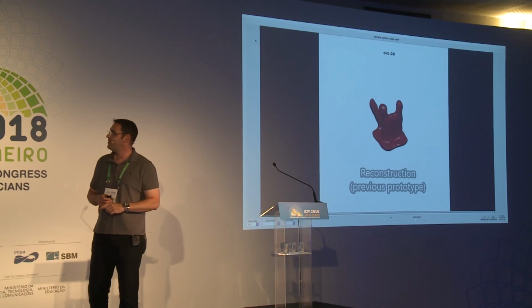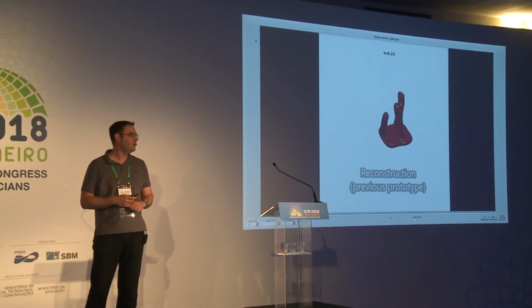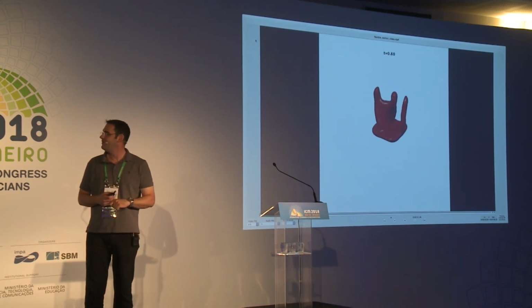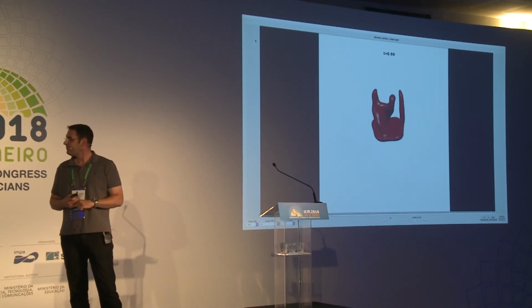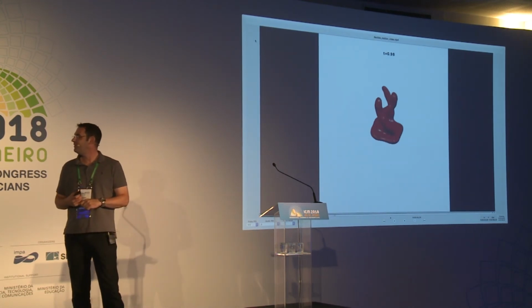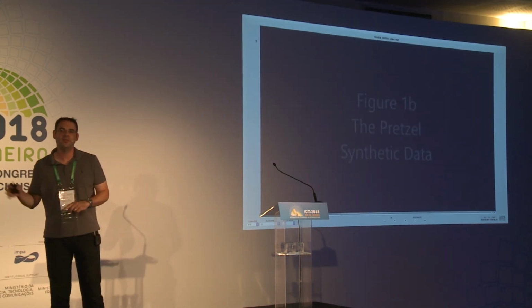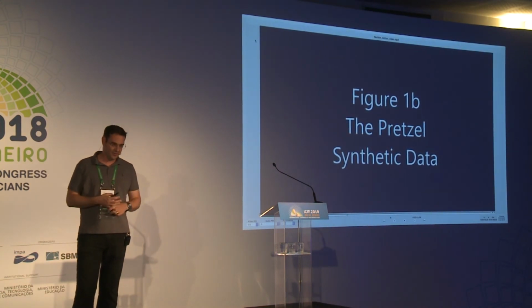So that's a reconstruction. Okay, so you see that we can actually do quite a good job in getting the major features of heterogeneity here, the continuous heterogeneity. I should mention that procedures based on EM completely fail for continuous heterogeneity, because there are just too many parameters to update here.